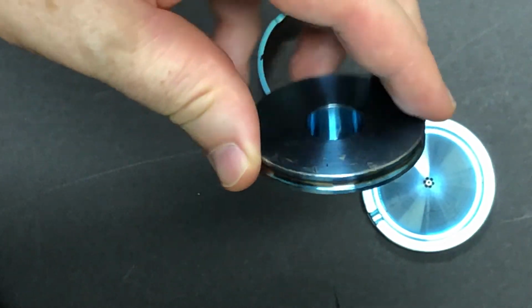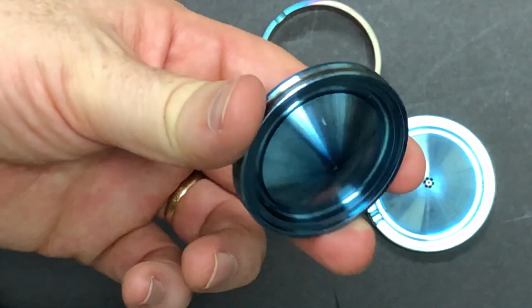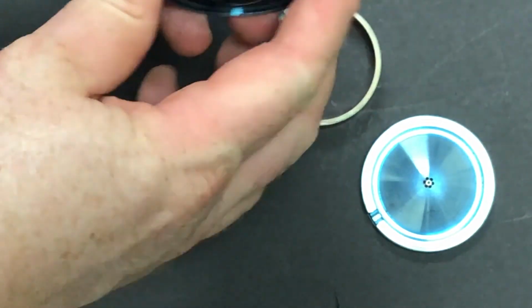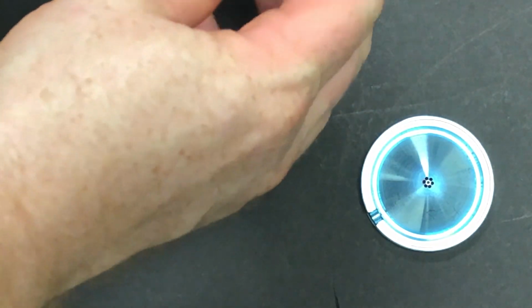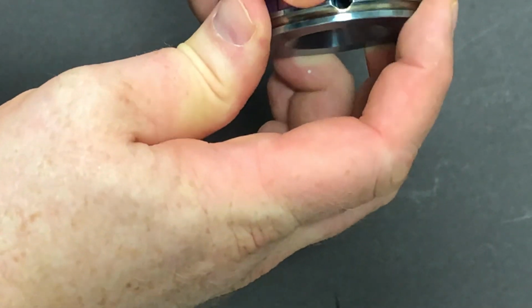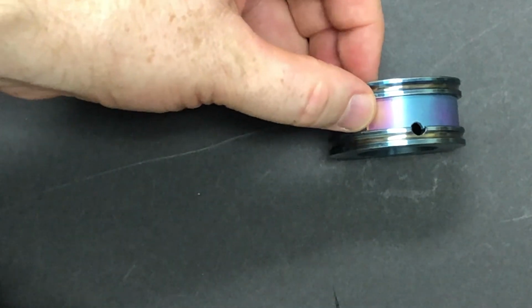This is different than the quadrupole, where if you were thrown out, you were not detected. You had to make it through to be detected. In the ion trap, it traps everybody. And the way that you get detected is you get thrown out of that end cap with the pinhole, and the detector is right there. So if you get thrown out of the ion trap, then you get detected.